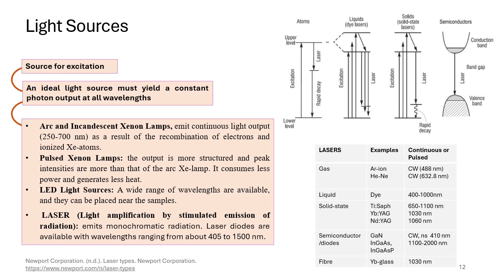Although in general it is very difficult to get this kind of light source, we can mostly achieve this by using a laser, as it emits monochromatic radiation, and a wide range of lasers is available in the market.